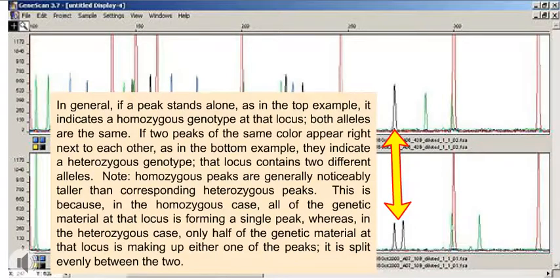In general, if a peak stands alone, as in the top example, it indicates a homozygous genotype at that locus. Both alleles are the same. If two peaks of the same color appear right next to each other, as in the bottom example, they indicate a heterozygous genotype; that locus contains two different alleles.